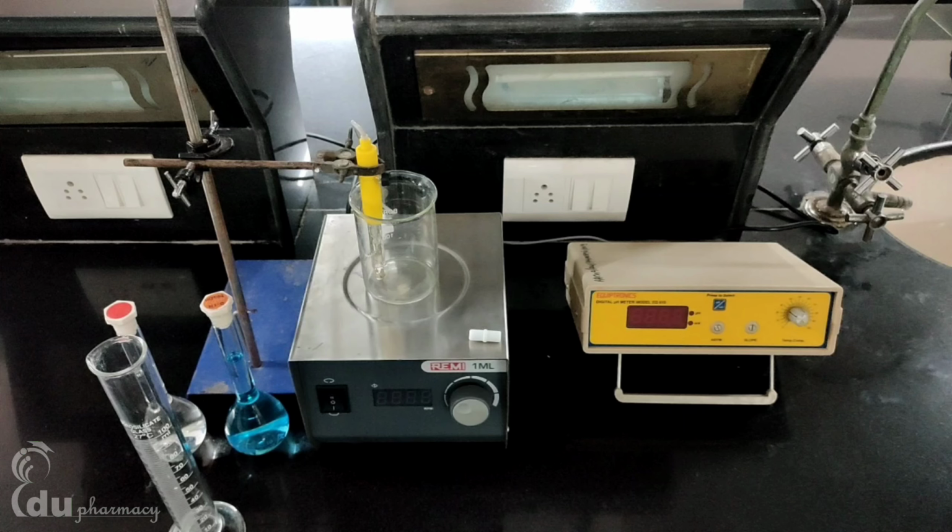The pH meter is already calibrated as per the standard procedure. You can follow the instruction manual of this instrument to know how it can be calibrated. The pH electrode is to be fitted in the beaker.